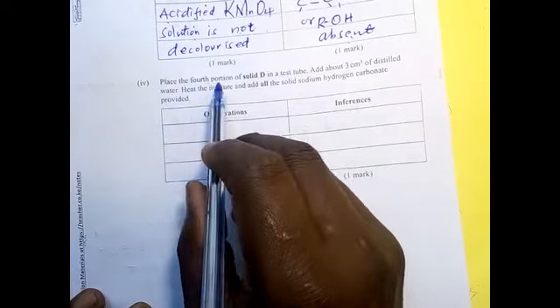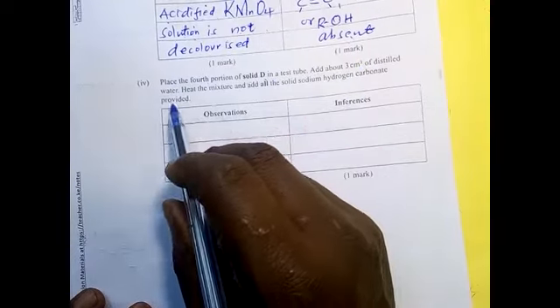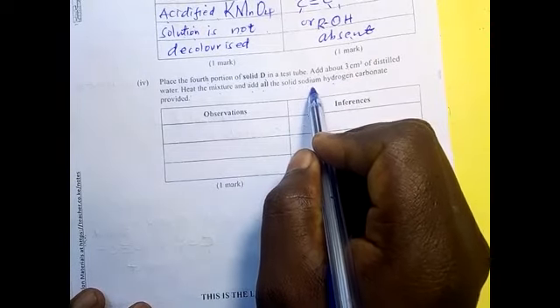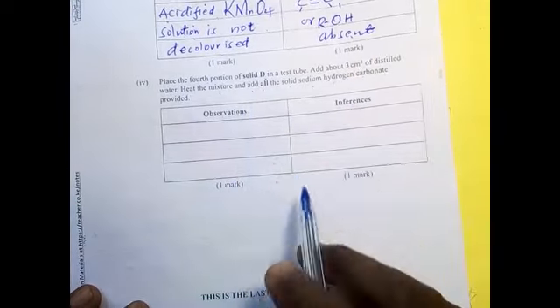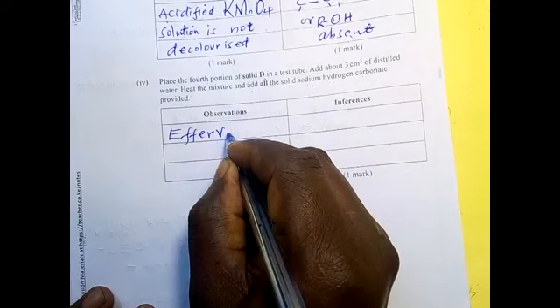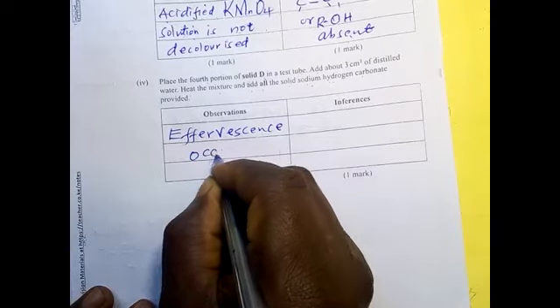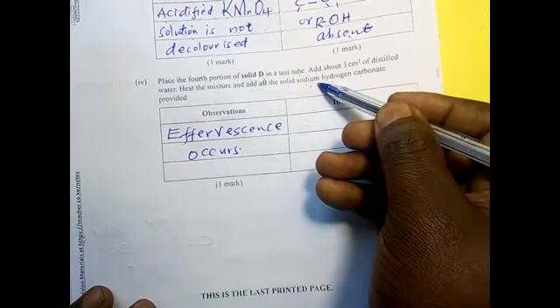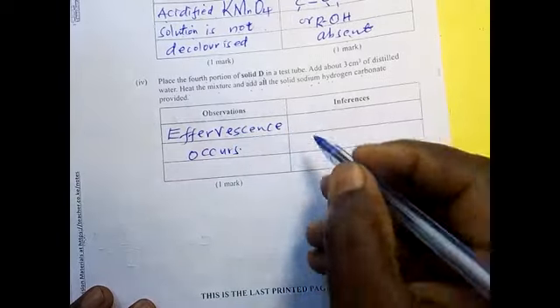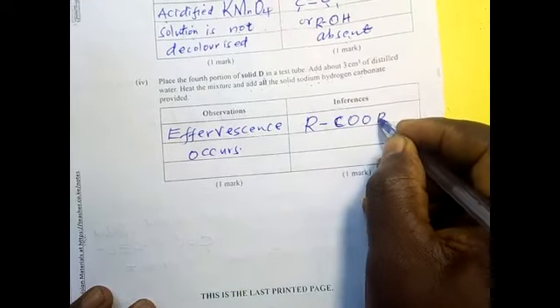Finally, place the fourth portion of solid D in a test tube, add about 3 centimeters cube of distilled water, heat the mixture and add all the solid sodium hydrogen carbonate provided. Then effervescence occurs. That now confirms actually that the solid was an acid. Carbonate plus an acid, we always expect carbon dioxide to be produced, therefore effervescence will occur. That confirms that the alkanoic acid is present.